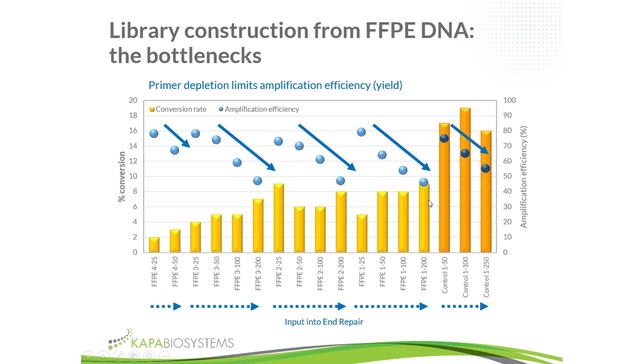And this is something that's easily been fixed, but it's worthwhile assessing, because if amplification efficiency is not as efficient as it should be, you're obviously going to get lower yields, or do too many cycles of amplification. That's just something you should be aware of and fix right up front when a library preparation workflow is being developed and optimized for the first time.